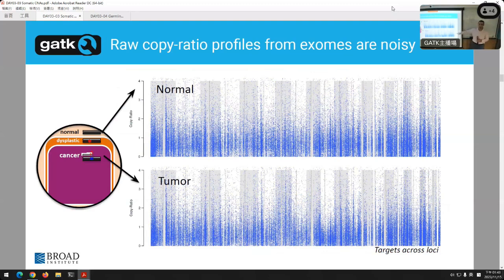All right, who can tell me where the copy number events are here? I will buy you a really nice bottle of scotch if you can tell me from this picture without cheating. Okay, it's impossible. So now we're going to show you the mathematical equations used to remove all the noise. That's what we're going to do for the next few minutes.